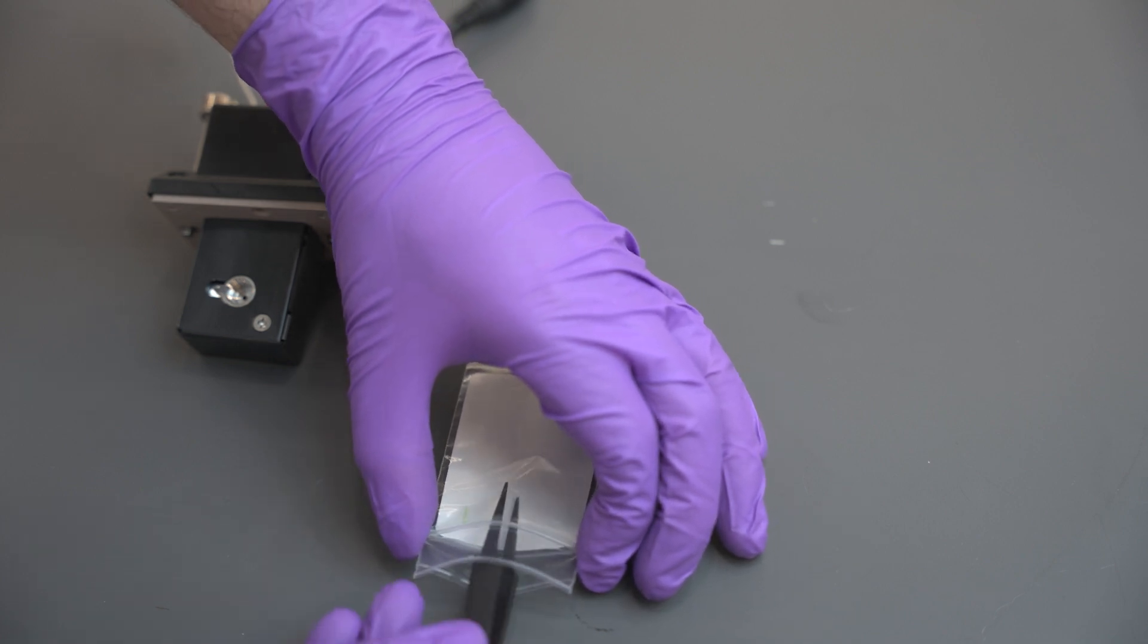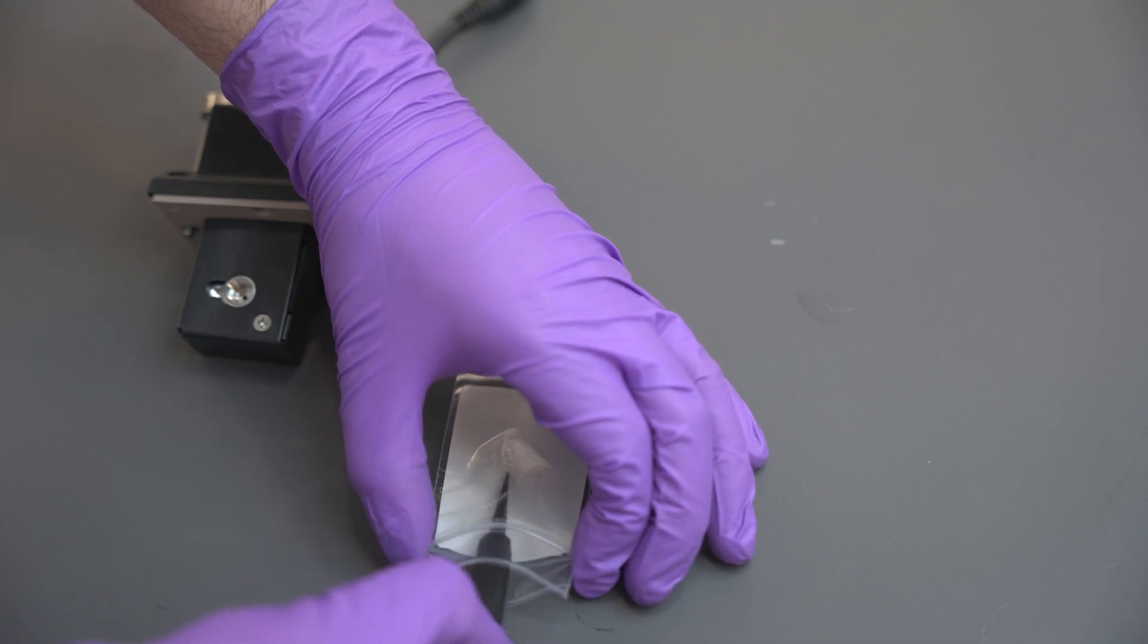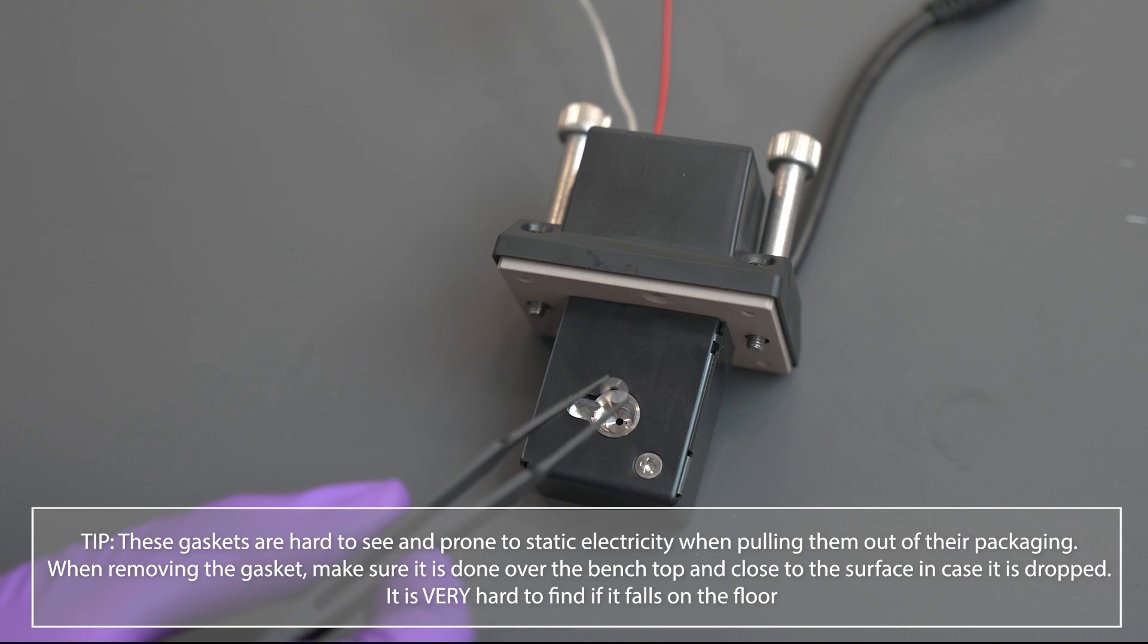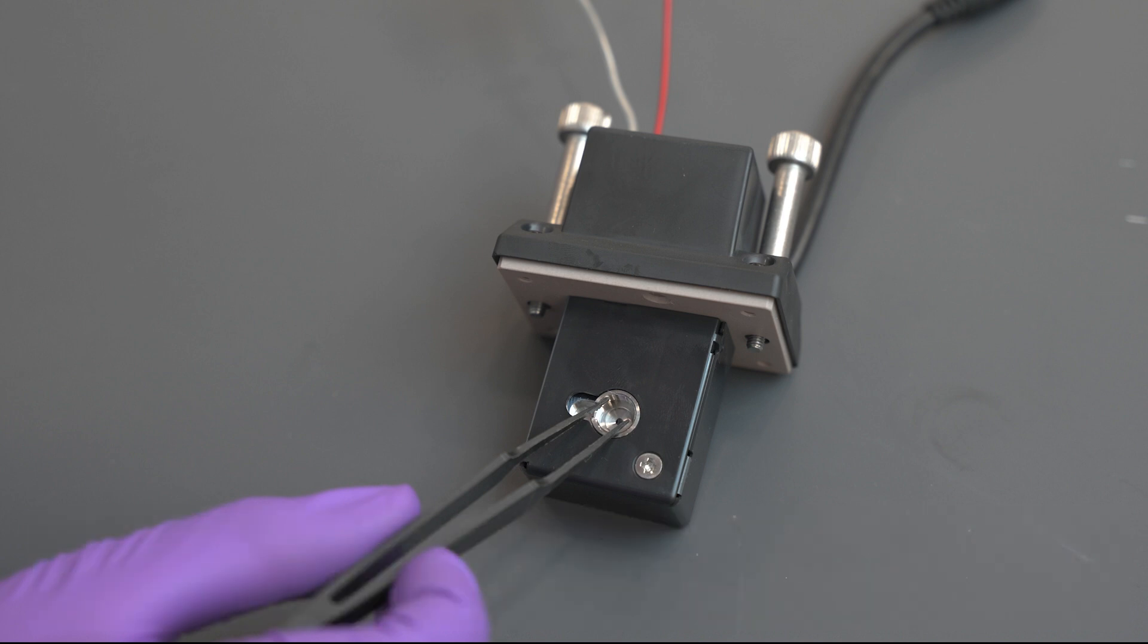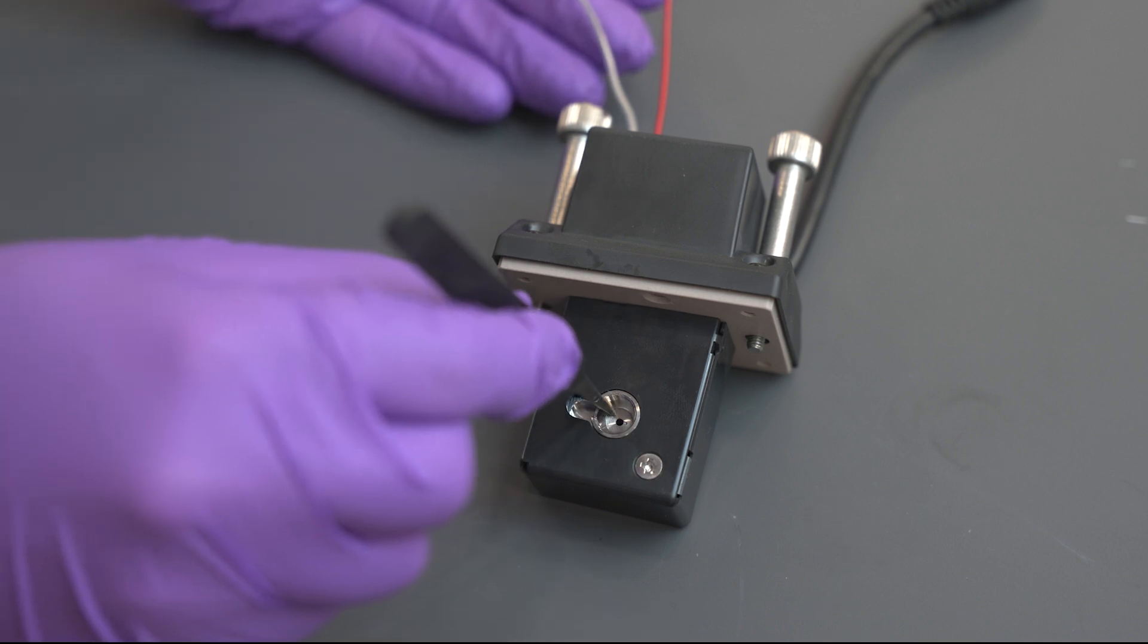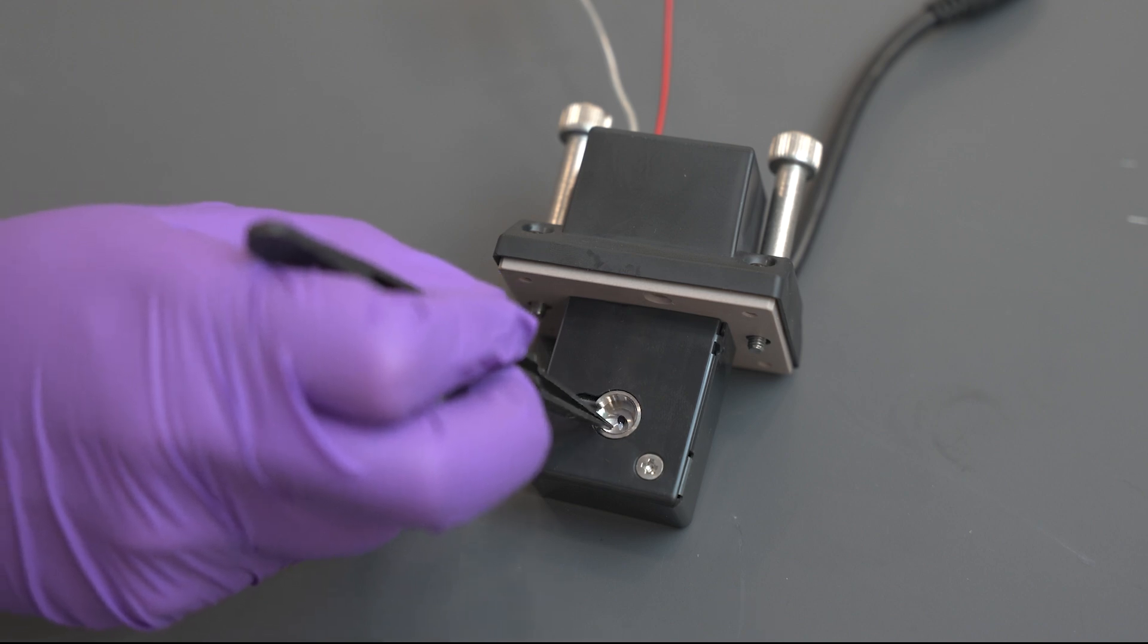Remove the lenses from their packaging with the plastic tweezers and set them on a clean piece of wiping paper. Carefully remove one gasket from the packaging with the plastic tweezers and place it directly into the flow cell housing. These gaskets are hard to see and prone to static electricity when pulling them out of their packaging. When removing the gasket, make sure it is done over the bench top and close to the surface in case it is dropped. It is very hard to find if it falls on the floor. Rotate the gasket to push out any air bubbles, preventing it from contacting the surface of the flow cell. Pick up one of the lenses with the plastic tweezers and place it above the gasket, flat side down. Make sure that it is seated properly.